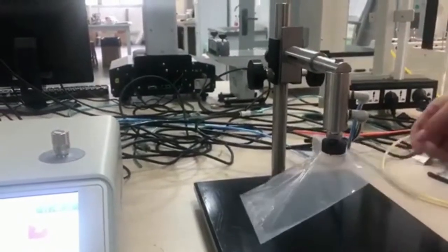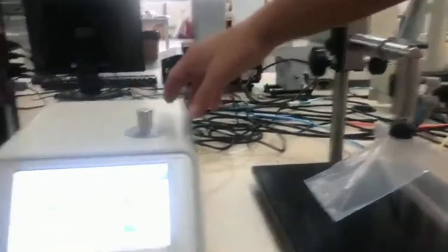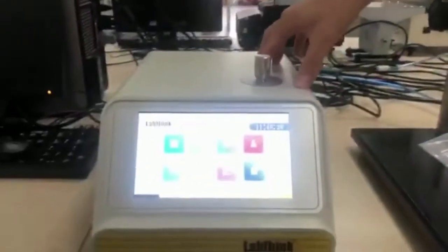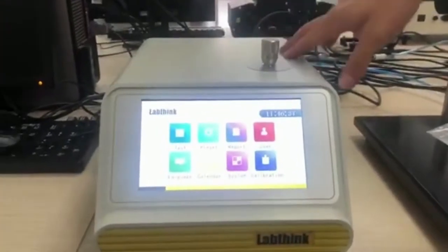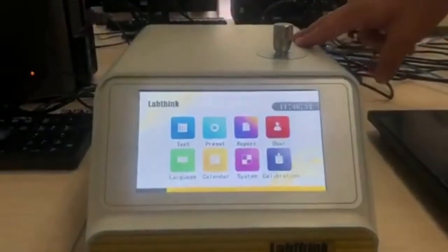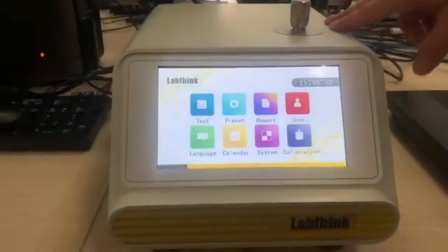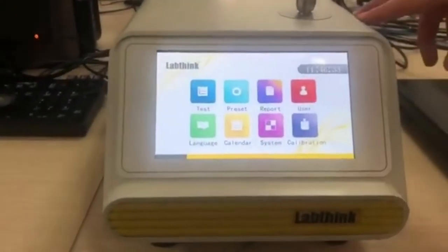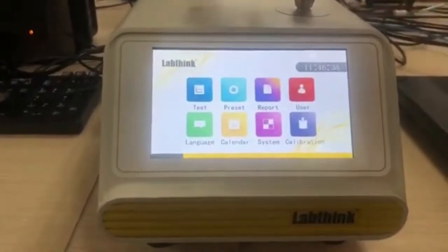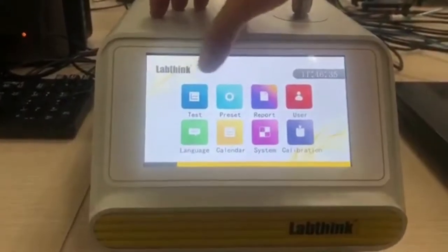Today I will show how to do the project decay test with this detector. First, let's come to the preset.